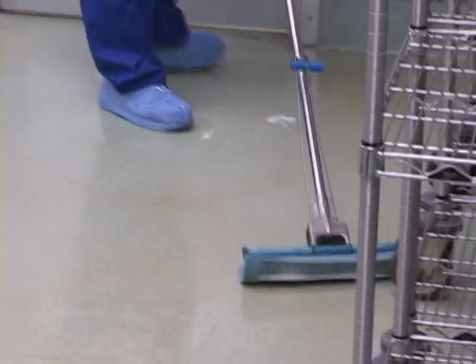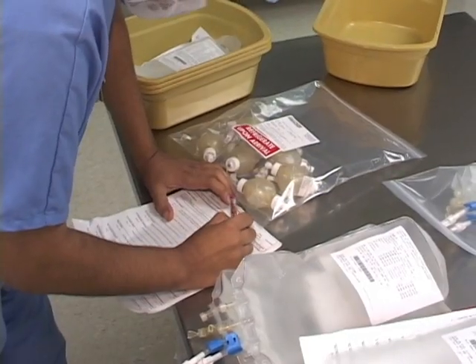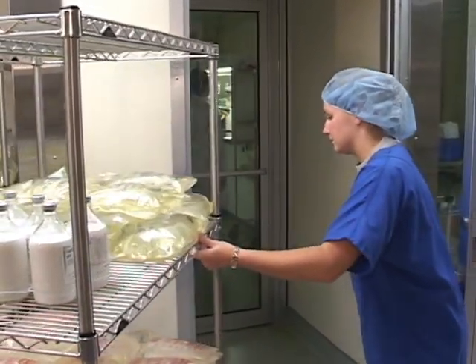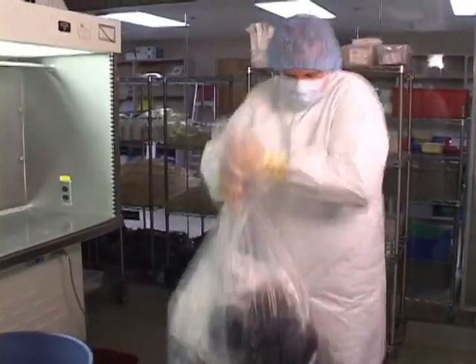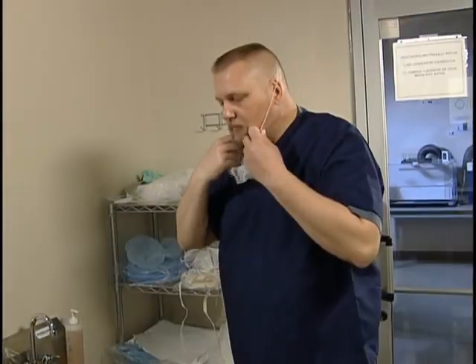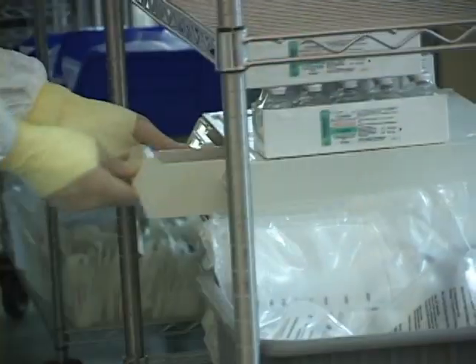You must follow standard operating procedures to maintain the integrity of the clean room. A clean room should be cleaned daily and segregated from normal pharmacy operations, non-essential equipment, and other materials that generate particles, such as cardboard boxes. Traffic flow into a clean area should be minimized. Floors should be disinfected daily with dedicated cleaning materials and equipment, and trash should be removed frequently and regularly from dedicated clean room trash cans. Clean rooms are often adjoined by an anteroom, used for non-aseptic activities related to the clean room operation, such as order processing, gowning, and handling of stock.